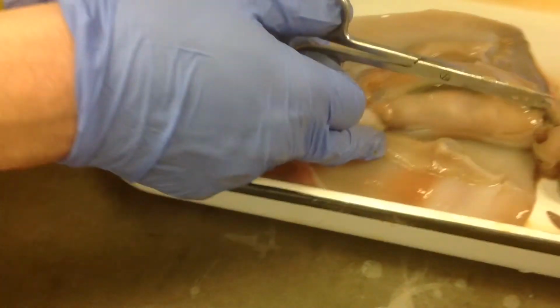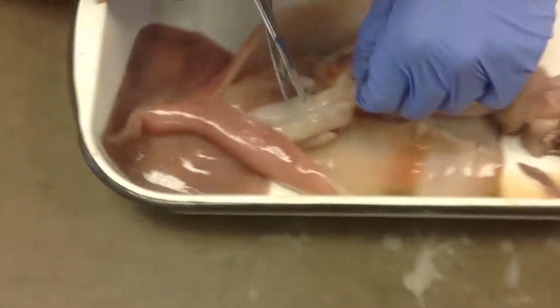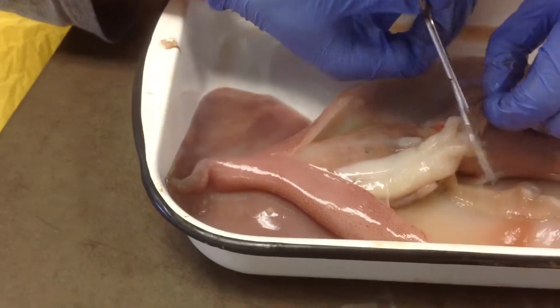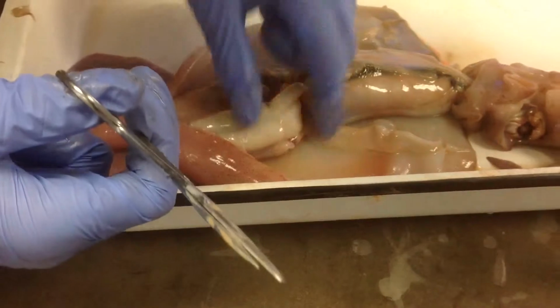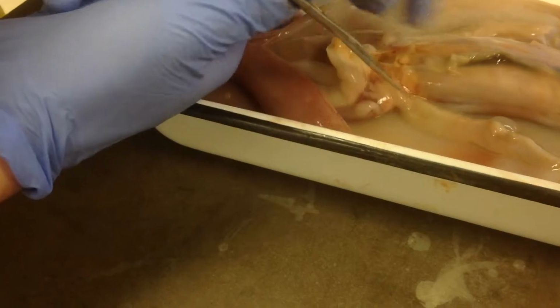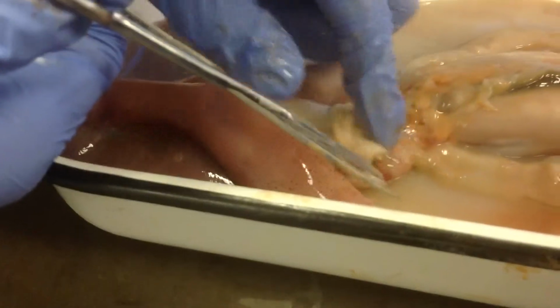Let's see where the gills are connecting to. Maybe we can find out what the lungs are in this organism, or the respiratory system, or whatever it uses to breathe. It does have gills. Possibly those two white masses are lungs. I don't know. They don't seem to be able to contract at all, so I don't think they're lungs. That could be the reason why there are gills. So the gills appear to be leading away from these white sacs. So you know what? It looks like there's an inner breaking of something.